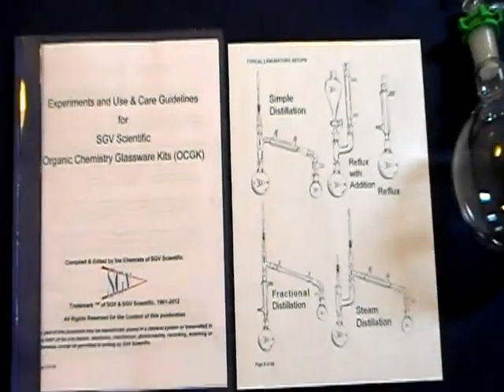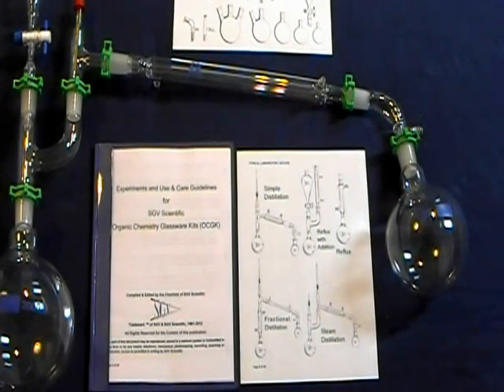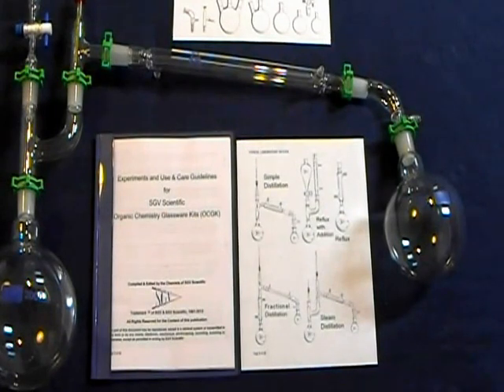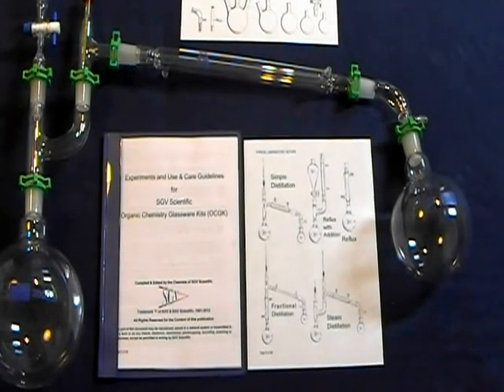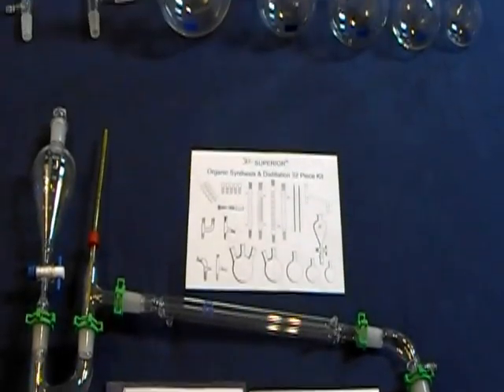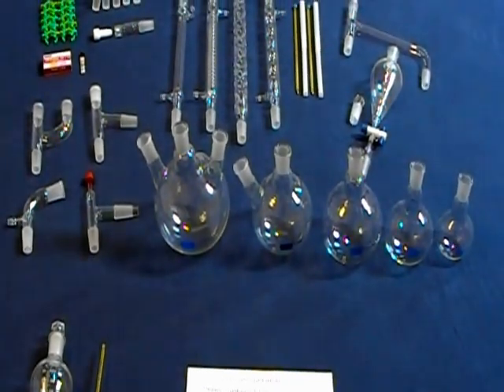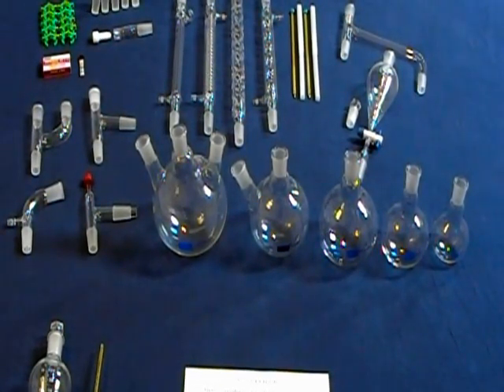In this experiments booklet, we provide instructions and detailed procedures, including graphics and pictures for performing organic synthesis, distillation, separation, and other organic chemistry processes. It provides practical help on how this glassware should be assembled and used, and the proper precautions that need to be followed to ensure safety. We also provide web access to one of the most comprehensive synthesis formularies that references over 5,000 procedures, considered to be one of the most reliable and carefully checked repositories for preparation and synthesis of organic compounds.